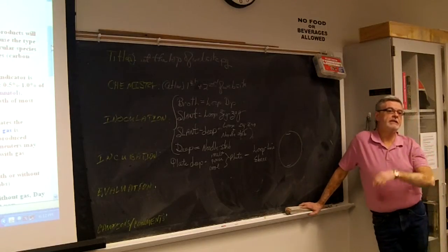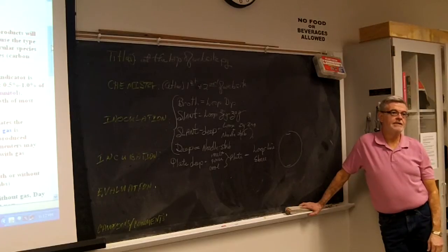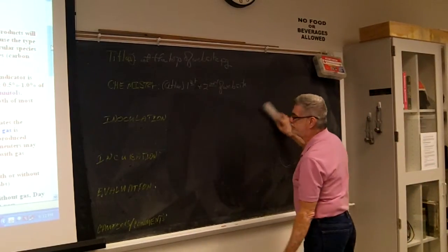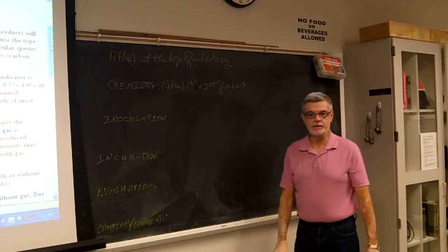Or motility gel deep. It's needle stab. Yeah. Sorry. All right. That takes care of that one. So the next one is incubation.